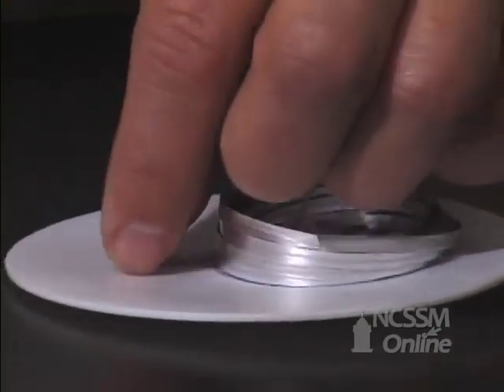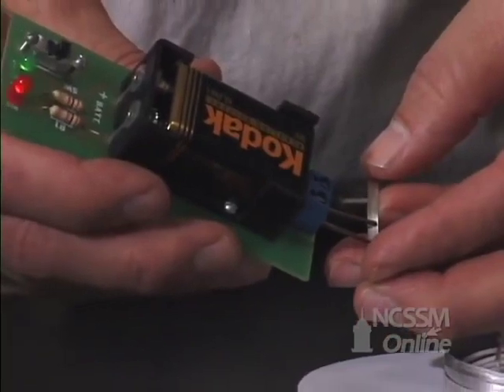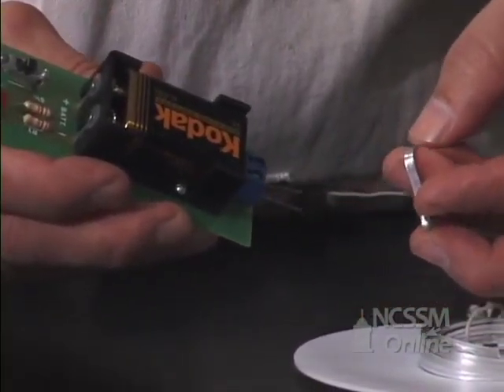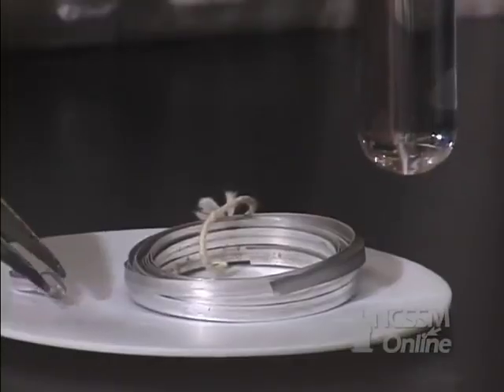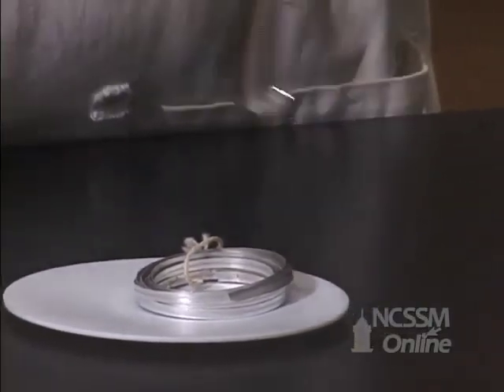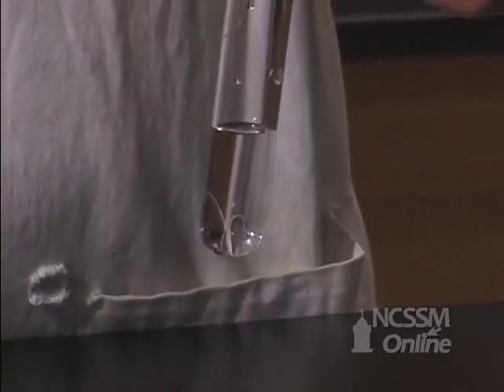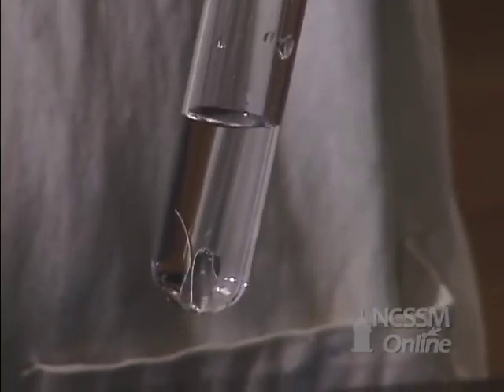The magnesium is an excellent conductor of electricity, as we can see using our conductivity tester. It's also a very malleable, flexible metal. If we add the magnesium metal to some water, we notice that the magnesium metal sinks. Group 2 metals are more dense than water. We also notice that there's no apparent reaction between the magnesium metal and the water.